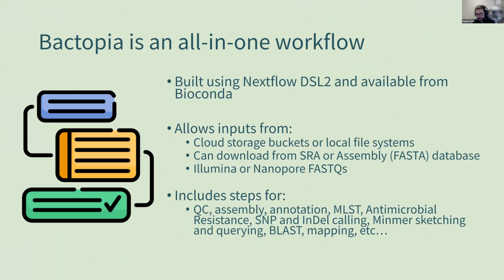It was built recently, I think less than 6 months ago or so. It's been completely converted to DSL2, which is so nice. The modularity is a huge weight off my back with Bactopia. It's built completely using Nextflow DSL2, and it's available on Bioconda, so you can just conda install Bactopia. I would definitely recommend using Mamba to create a new environment for Bactopia. It allows inputs from pretty much anywhere, and that's building off of having Nextflow on the back end.